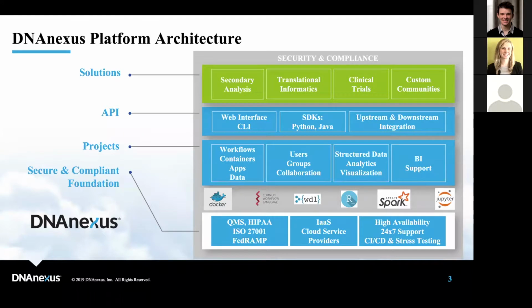We'll be covering these concepts as well as the scalability using the Spark backend in our subsequent webinar series. So this webinar will be focused on just the essentials, but the DNAnexus platform provides you a lot of flexibility in porting your own pipelines, as well as doing downstream exploratory data analysis.